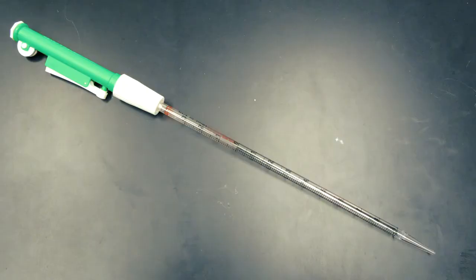To do this experiment, they used pipettes. They needed to grow the bacteria in liquid media, which they needed to precisely measure. Pipettes are a very handy tool for measuring precise amounts of liquid.